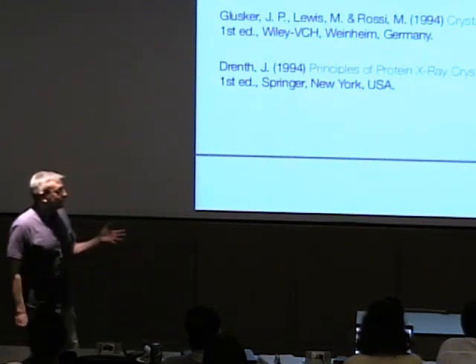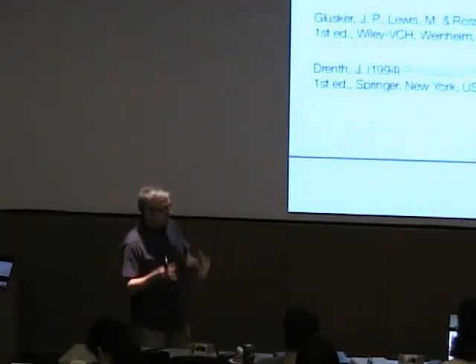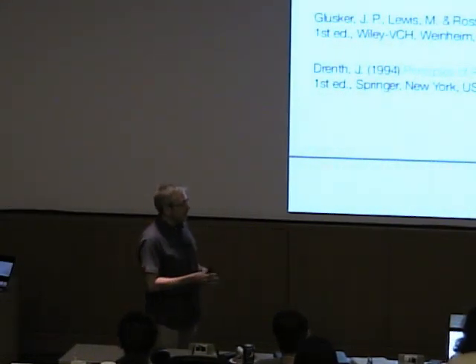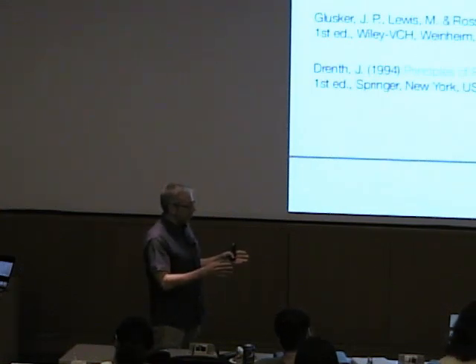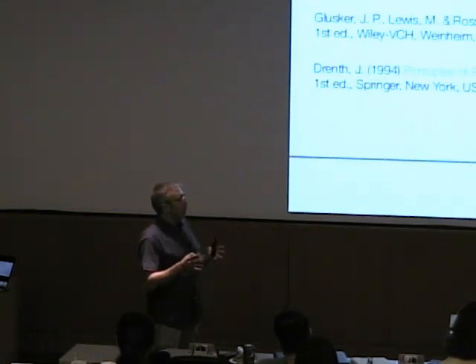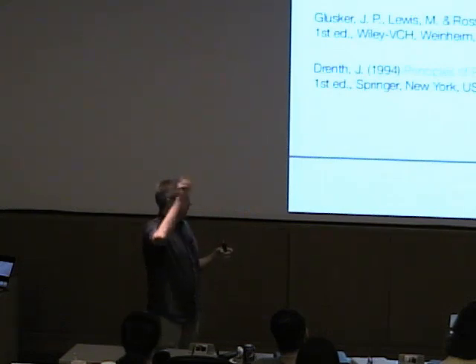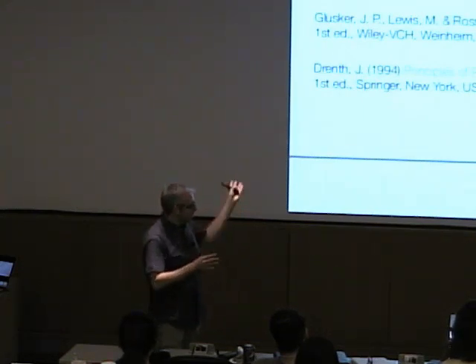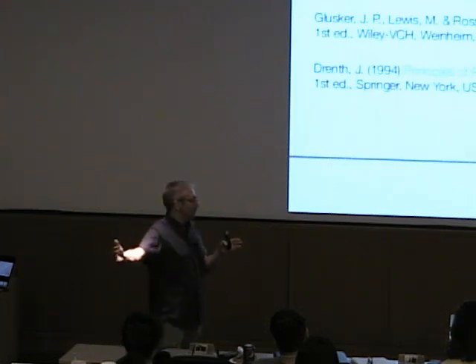So what you get is, of course, a typical feature of all kinds of Fourier transforms. You also get this in Fourier transforms of spectra. And in principle, the Fourier transform reproduces a perfect representation of your object if you integrate over all of space. It's kind of an infinite integration, right? If you sum, in our case, an infinite number of structure factors. But we don't have that, of course.